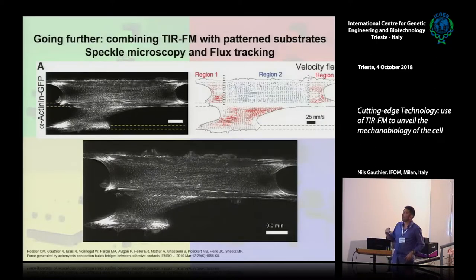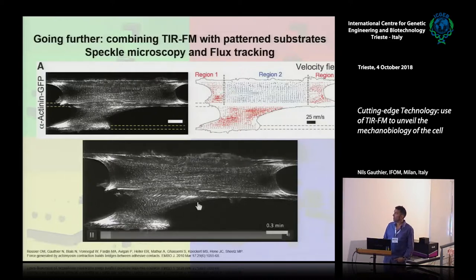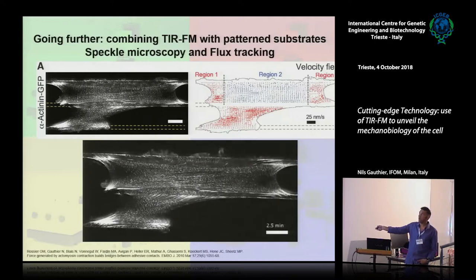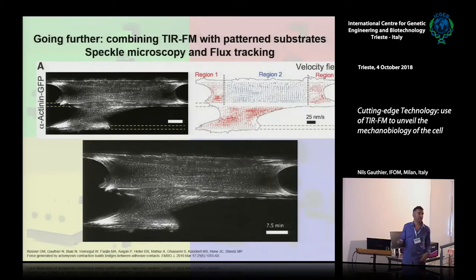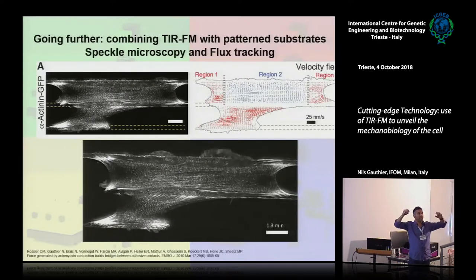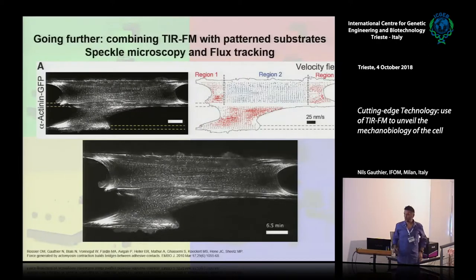You can also analyze, because you have a high signal to noise ratio again. We were analyzing the parameters of the edge of the cell, but we can also analyze molecular parameters inside the cell, particularly when they have this sort of speckle-like microscopy behavior, and you can see there are flows. You can see the flow of molecules here, and then you can use PIV, a particle analysis, where you track all the flow, and then you understand the behavior and so on.